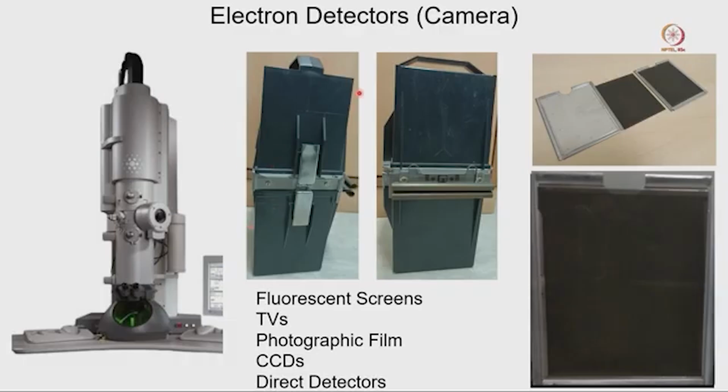So, here is the chamber where we keep the photographic film. Those are the photographic films, and we keep them at the top. If you look, this is the photographic film cassette, where we can put the photographic film inside. If you look, this will be 6 centimeters and this will be 9 centimeters, and this is the entire photographic film fitted in this particular cassette, and this individual cassette will go here, and we have to stack them one by one like that.